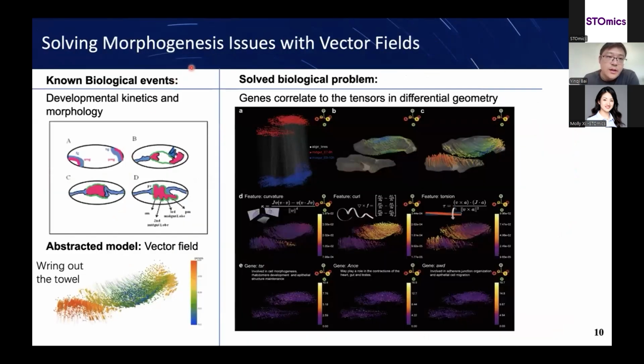Finally, I will introduce a cross-time analysis in our spatial toolkit. The showcase is Drosophila development. The midgut is originally divided into two parts, anterior and posterior. During development, this midgut fused into one organ. However, this is not the end of the development. The midgut will be twisted so that the food will stay in the midgut for a longer time for digestion.